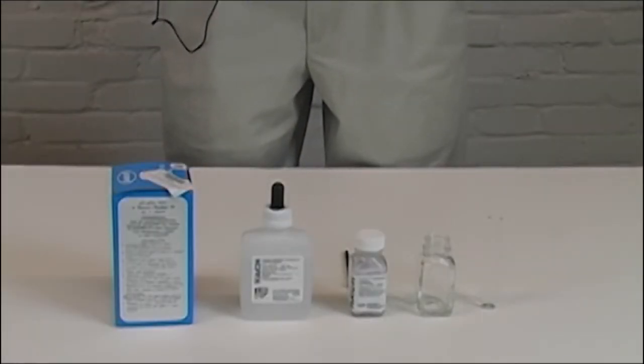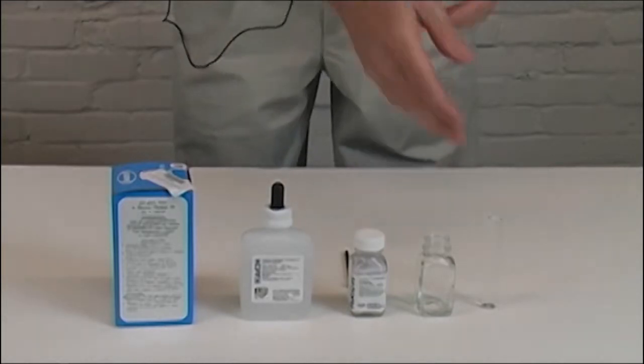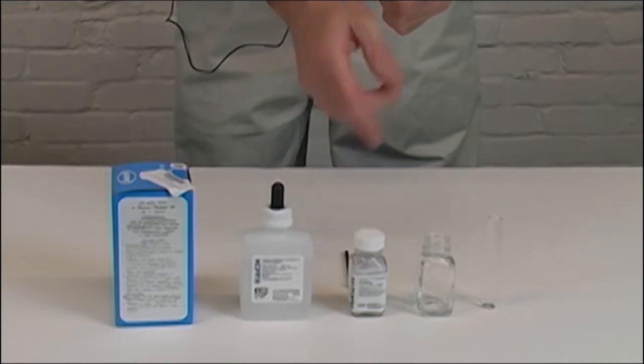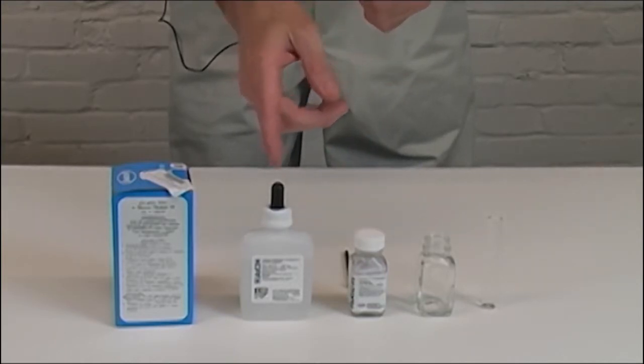Everything that's needed for testing the hardness of your water comes all in one kit. It comes with your measured vial, it comes with your mixing vial, your hardness agent, and your titrant solution.